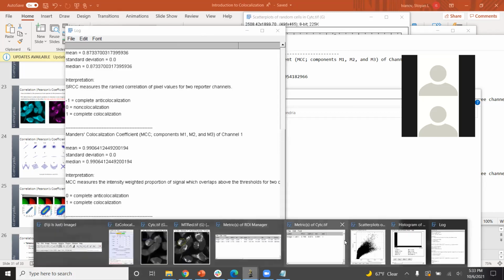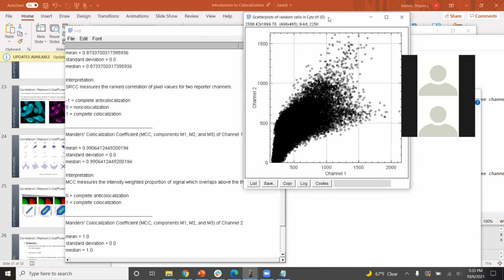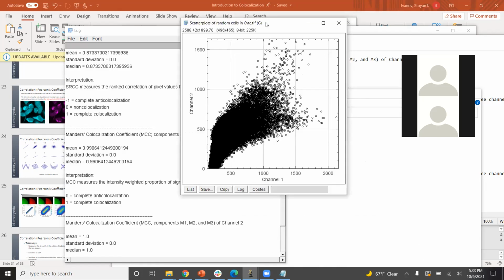As well, any considerations you made in defining your ROI, just take the reader through what you saw and why you think it indicates colocalization. So the coefficients, definitely the scatter plot. So maybe the figure images side by side. I'll show the table or the data, right?